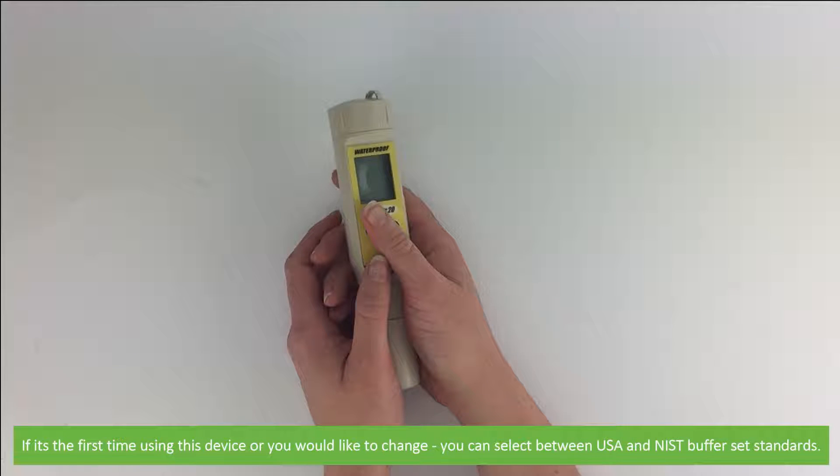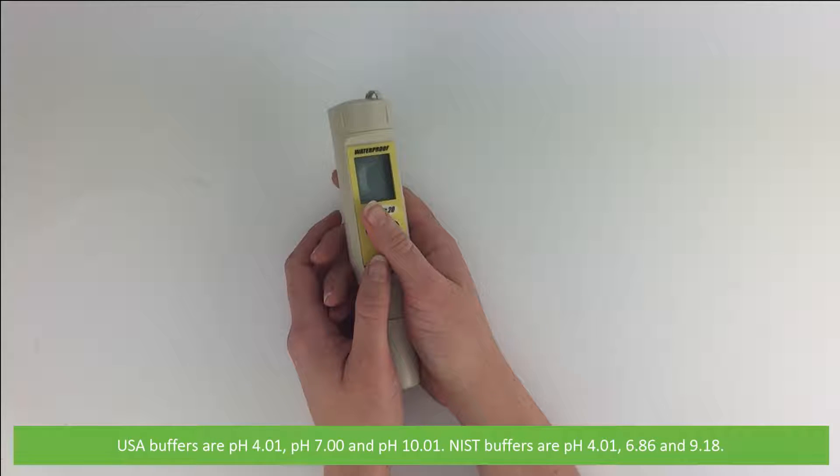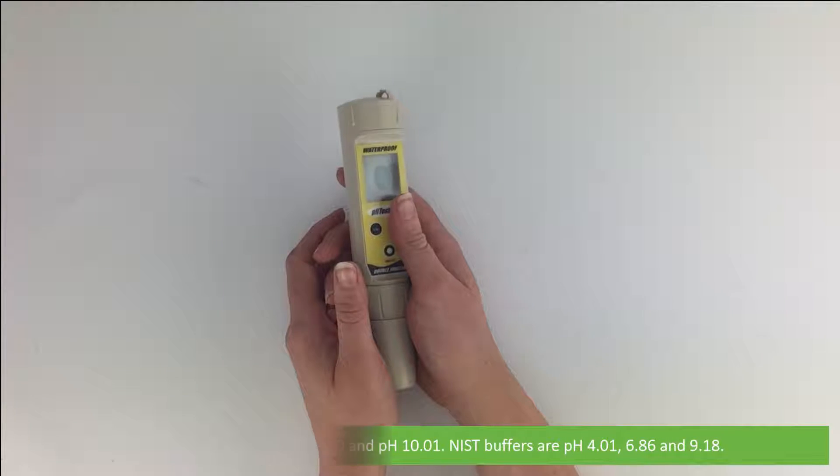If it's the first time using this device, or you'd like to change, you can select between USA and NIST buffer set standards. USA buffers are pH 4.01, pH 7, and pH 10.01. NIST buffers are pH 4.01, 6.86, and 9.18.